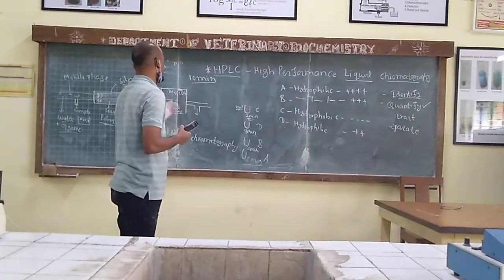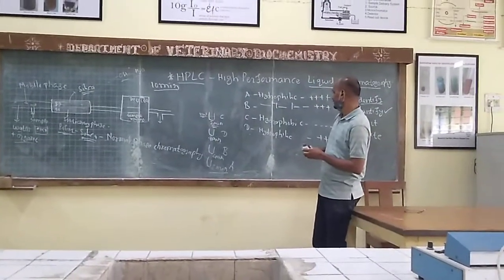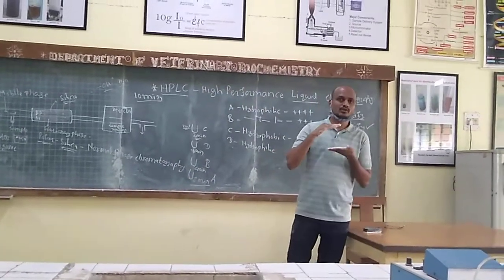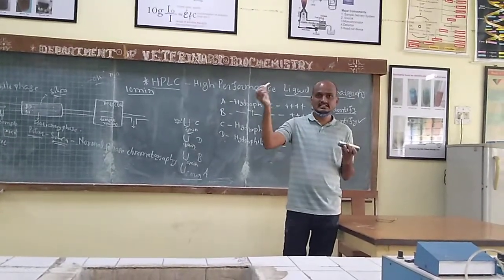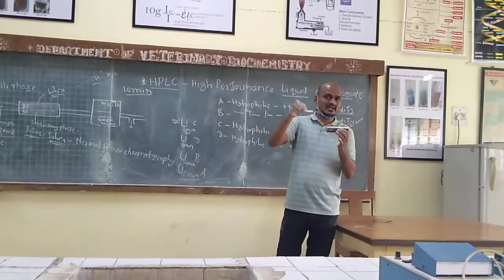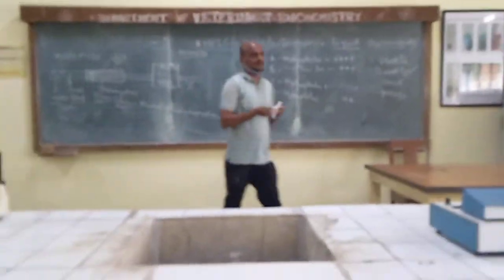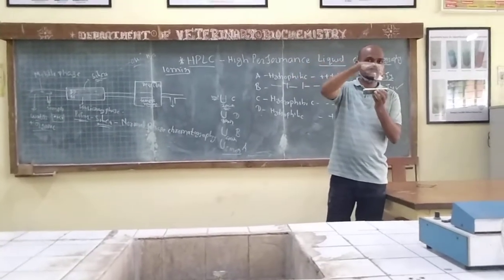2 minute position? Because silica is polar and the C is a hydrophobic molecule, so to silica the hydrophilic molecules get attached. Okay. So it will elute first. So we have column. The column is filled with silica. Silica is hydrophilic. This is what molecule she told? C molecule. It will be passing. A is passing, B is passing, C is passing, D is passing, right? So we have ABCD molecule. All 4 are passing. Okay. ABCD. All 4 are passing through this column.